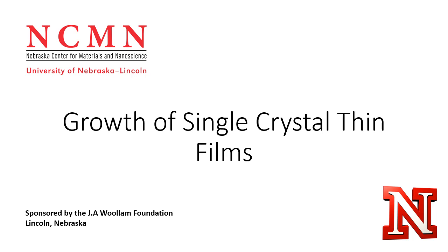Hello, in this video you will learn about how we grow single crystal thin films using pulsed laser deposition.